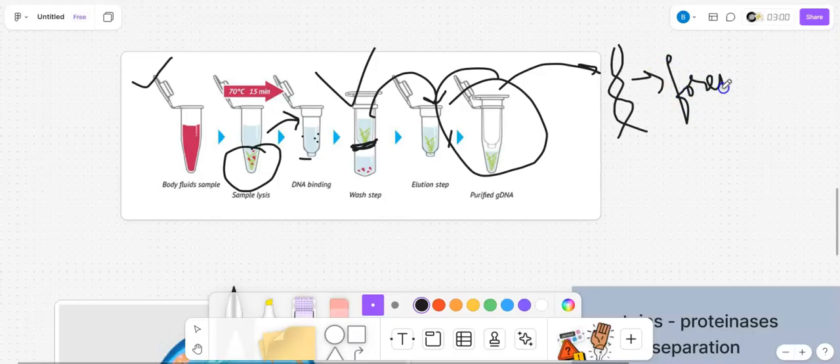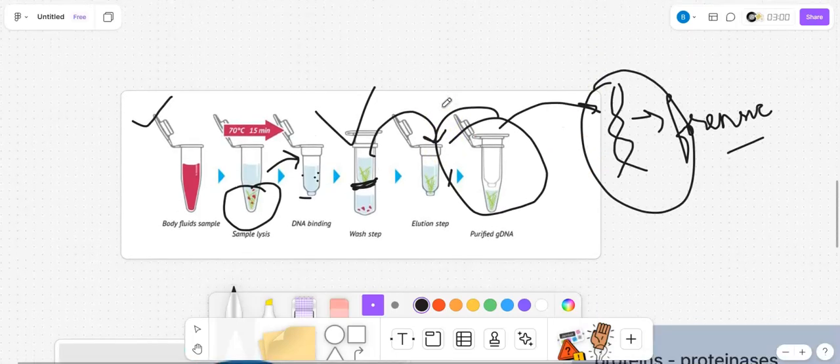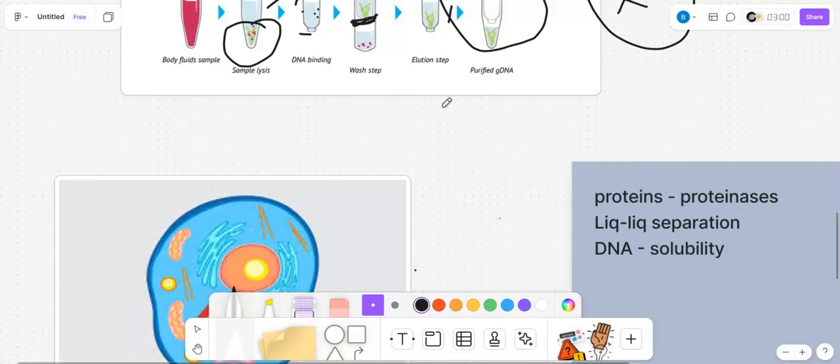ఈ purified DNA దేనికి ఉపయోగపడుతుంది? A number of things, even during forensic analysis. Like, you found a blood sample at a crime scene. ఆ blood ఎవరిది, who was the criminal or who was the victim there అని తెలుసుకోవడానికి this DNA will be helpful. DNA డైరెక్ట్ గా రాదు కదా, ఈ process అంతా చేస్తే we'll get the DNA and we can find the culprit.